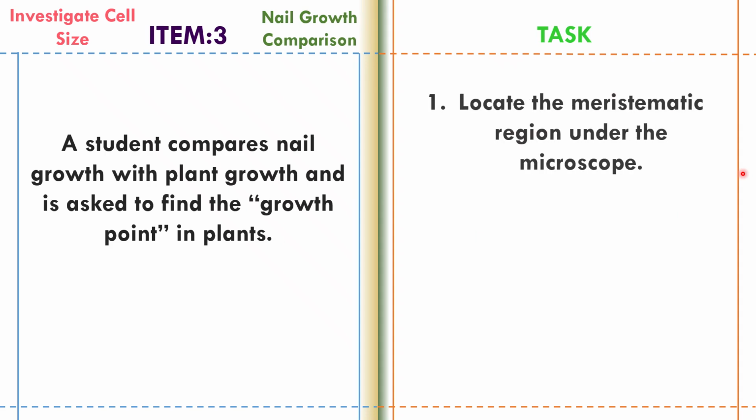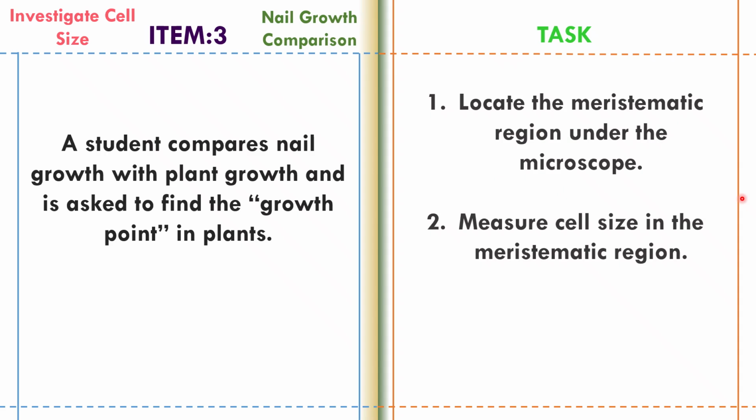Tasks: locate the meristematic region under the microscope; measure cell size in the meristematic region; explain why cells here are smaller.